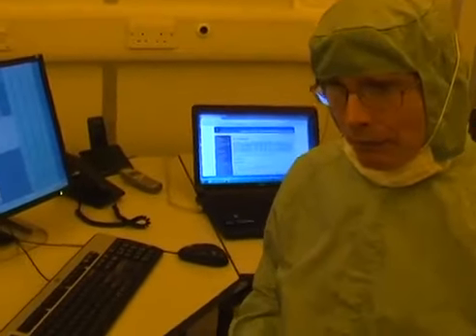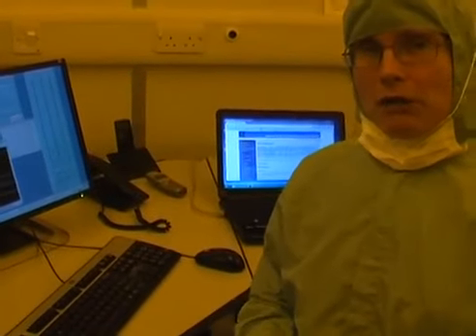Okay, so we saw when we were loading this sample that there were some problems with the tiltedness of the sample, and this was really caused by the fact that the sample was very small and mounted onto a silicon piece. But very often we can have problems which are self-inflicted by the user, and it's worth spending a few minutes just thinking about top things which cause problems and ways to avoid them. So let's go back right to the beginning.